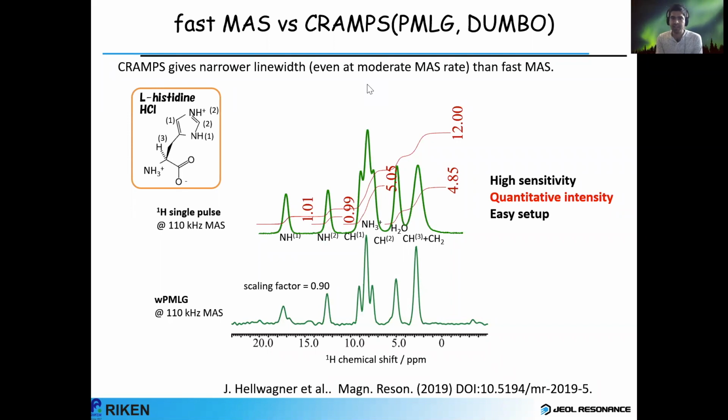So the next question is from Eddie Saliba. Were the spectra that were pieced together excited adiabatically? Yes, right. Let me check it. If I remember correctly, that is adiabatically excited, but I need to double check it. But that was already published three years ago.